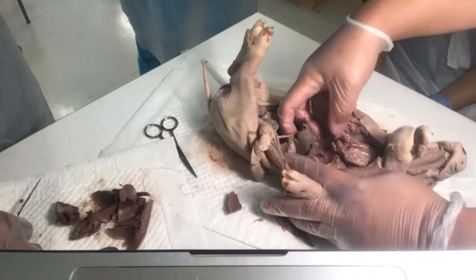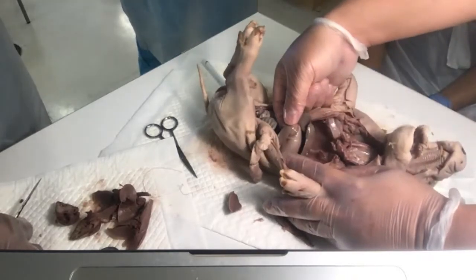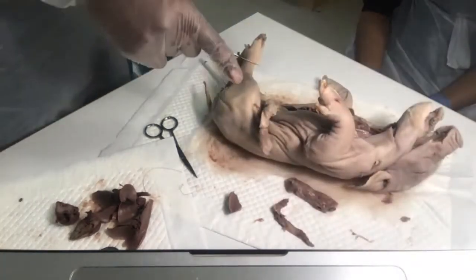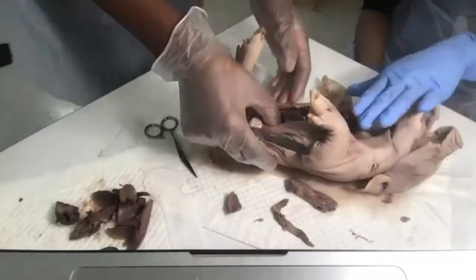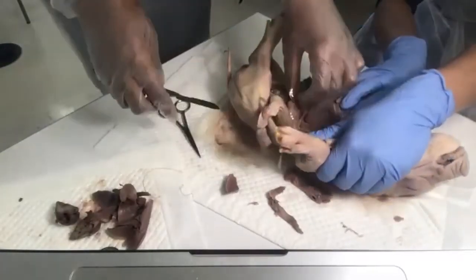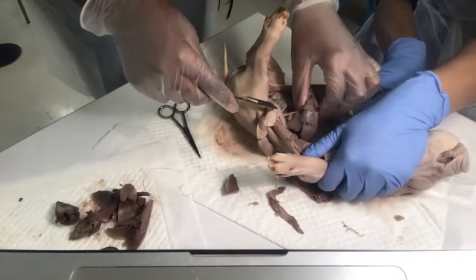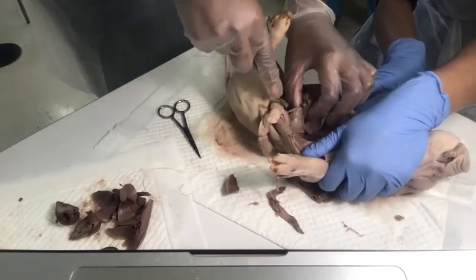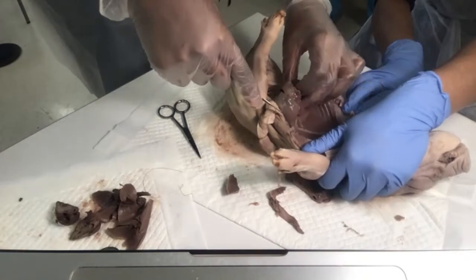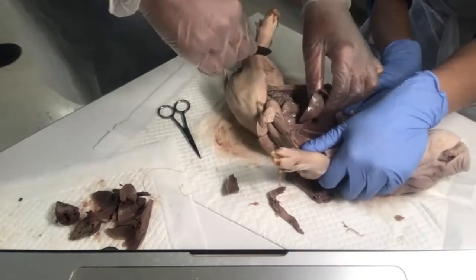And while you're there, the stomach and this little thing here, it looks like an eel, the pancreas. So go cut. Take that out. Yep, three things: stomach, liver, and pancreas. Now this makes sense because the pancreas is intimately associated with the stomach. The liver is intimately associated with the stomach. The liver and the pancreas are accessory organs to your gastrointestinal system, but they're really important, especially the liver.